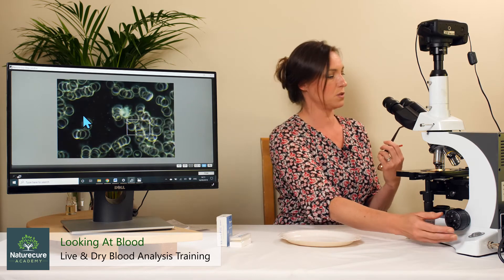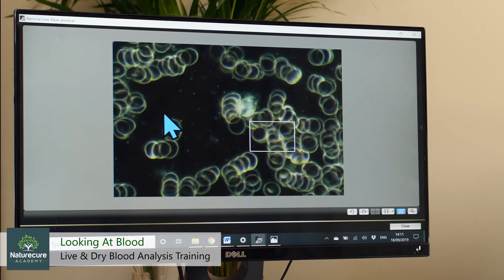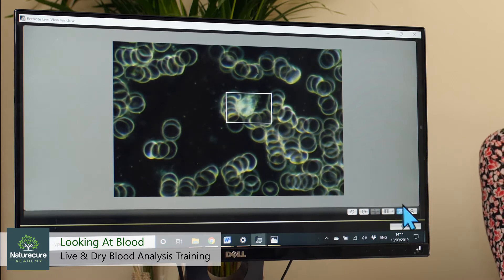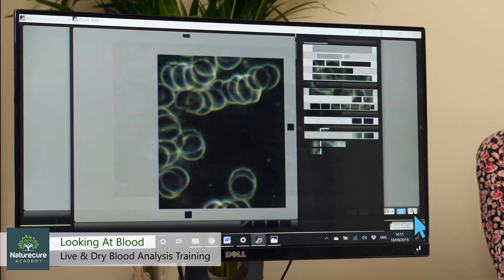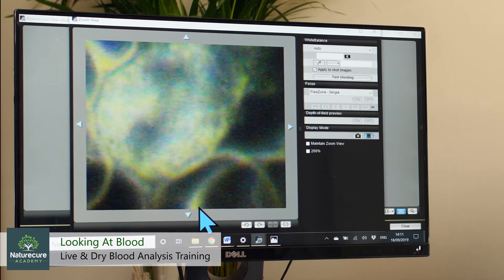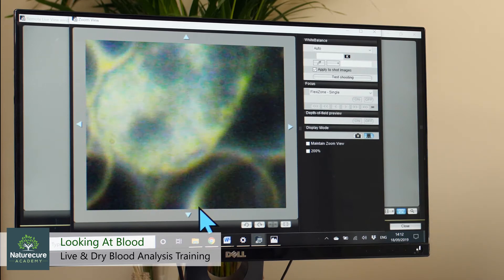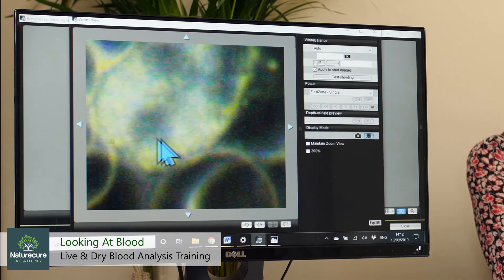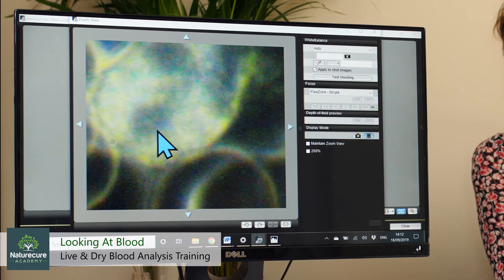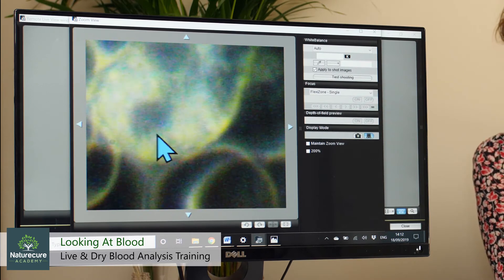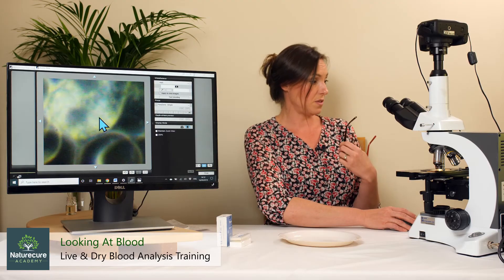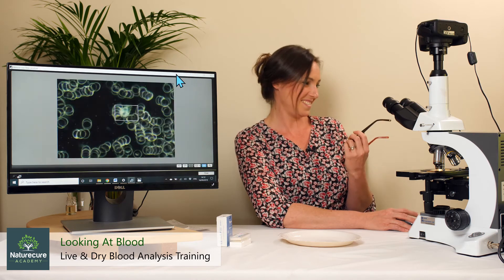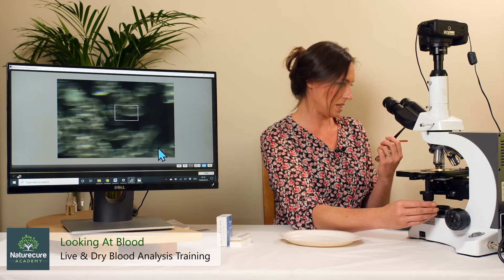There's a white blood cell — again it's a small one but you can start to see it. Let me blow that up a little bit more and fine focus it. Here you can see a very gray area — these are actually the lobes of the nucleus of the white blood cell. They should be a lot more defined. So that's a white blood cell with gray fuzzy nucleus lobes.